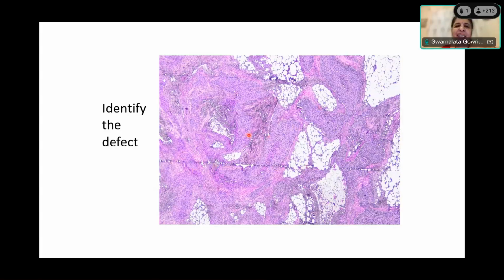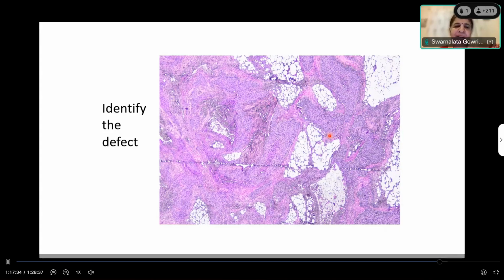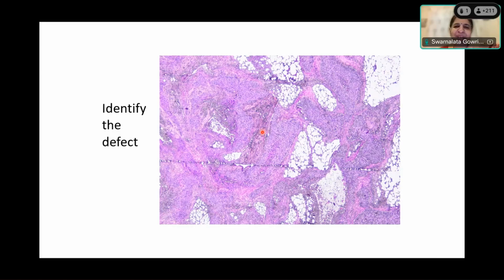But why is it looking like this? Some brown here. It's not a good section, right? Yes, ma'am. What do you think is here? Ma'am, formalin pigment maybe. You can mistake it for formalin pigment, but this is not formalin. I'm telling you that you're getting these black, brown here everywhere, and you are not seeing anything. Thick section, somebody said, no, actually the section was quite good. I sort of purposely made this artifact so that it is what I'm going to tell you it is.